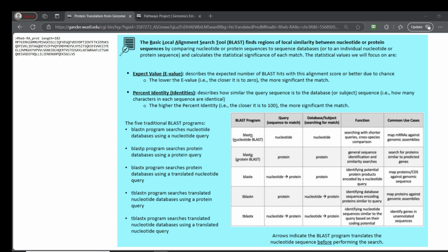yakuba. For this BLAST search, we will be using tblastn to search the translated nucleotide database of our target species, D. yakuba, using the protein sequence of Rheb in Drosophila melanogaster as our query. As you can see, with the table removed now, this was that sequence we copied from before. We will be using this in our search.